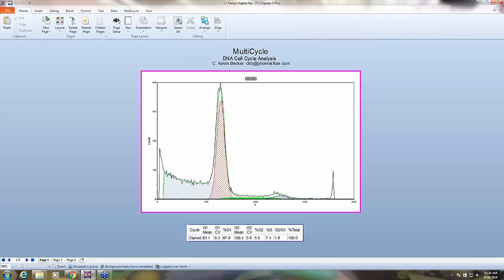Yeah, there's quite a few options for exporting these things. The standard export to PowerPoint works quite well, but really anybody can just right-click on a plot and choose to save that plot as a TIFF or a PNG or a JPEG. So there's a variety of different things that people may want to use. But if you want to generate a full report in PowerPoint, then of course export to PowerPoint is best for you. But if you really need one super high resolution image, you can simply do an export to TIFF or to PNG if needed.